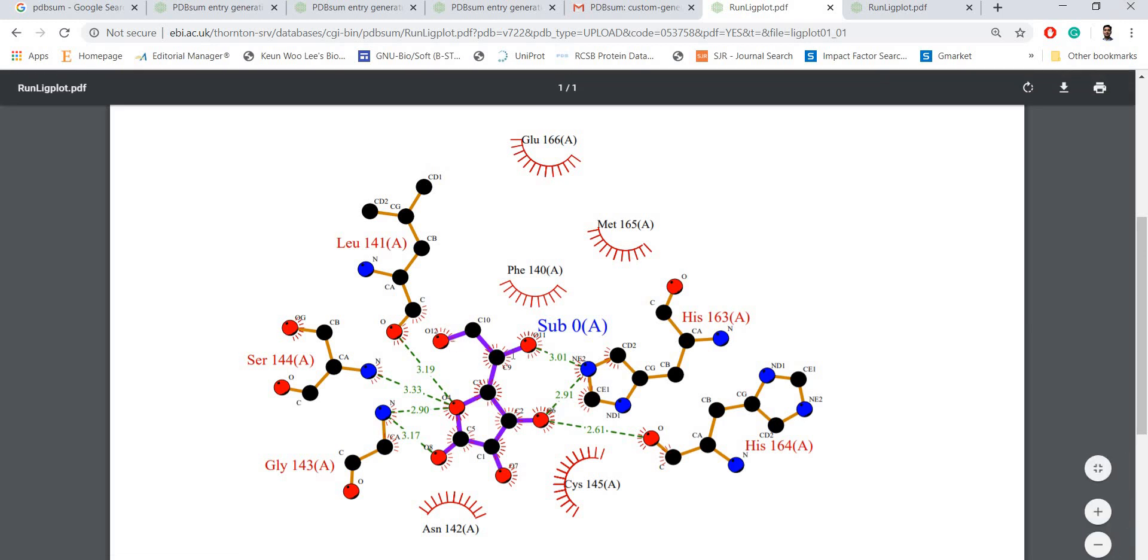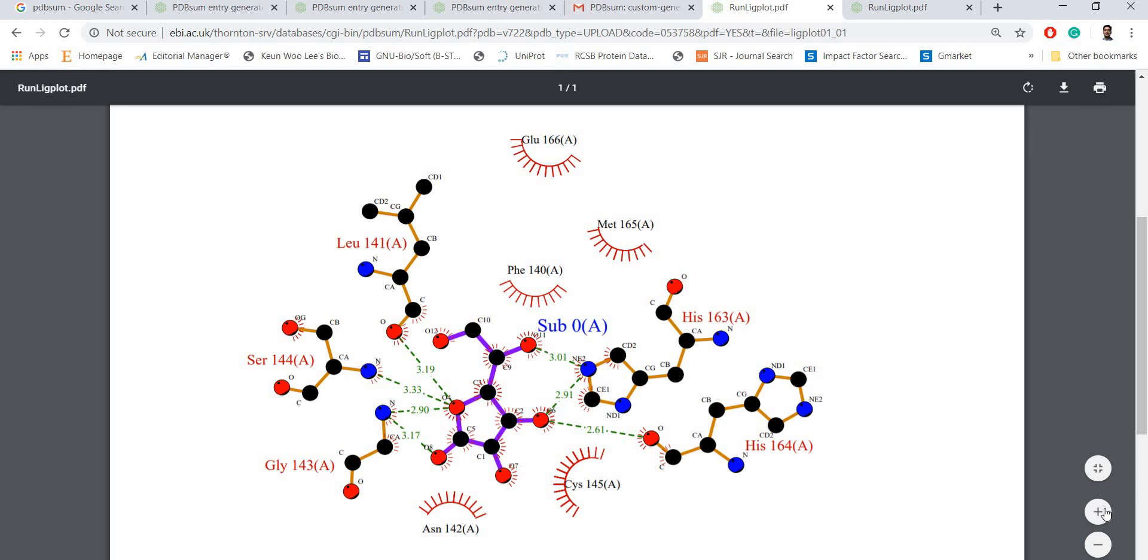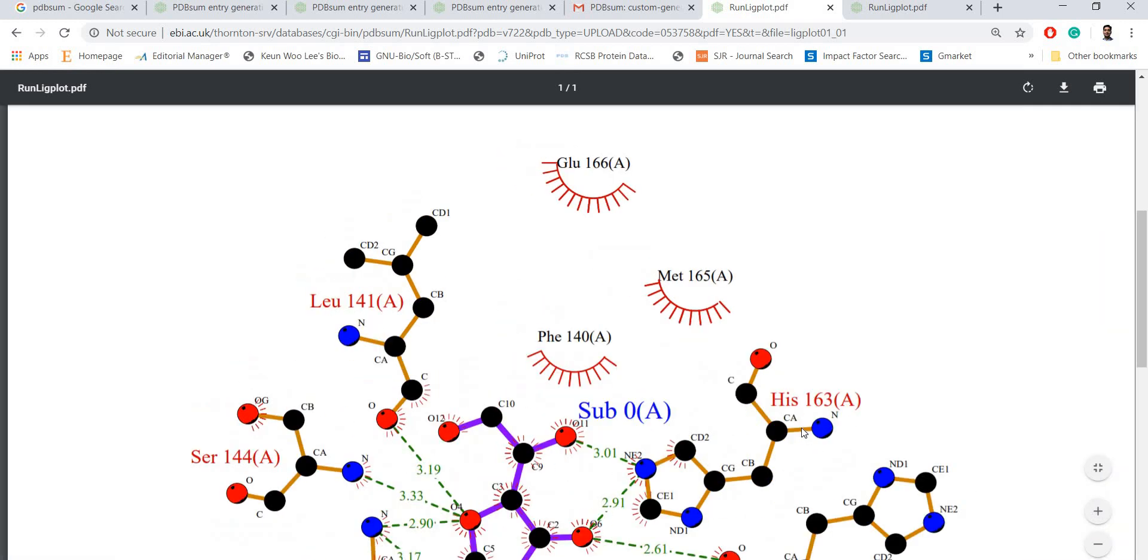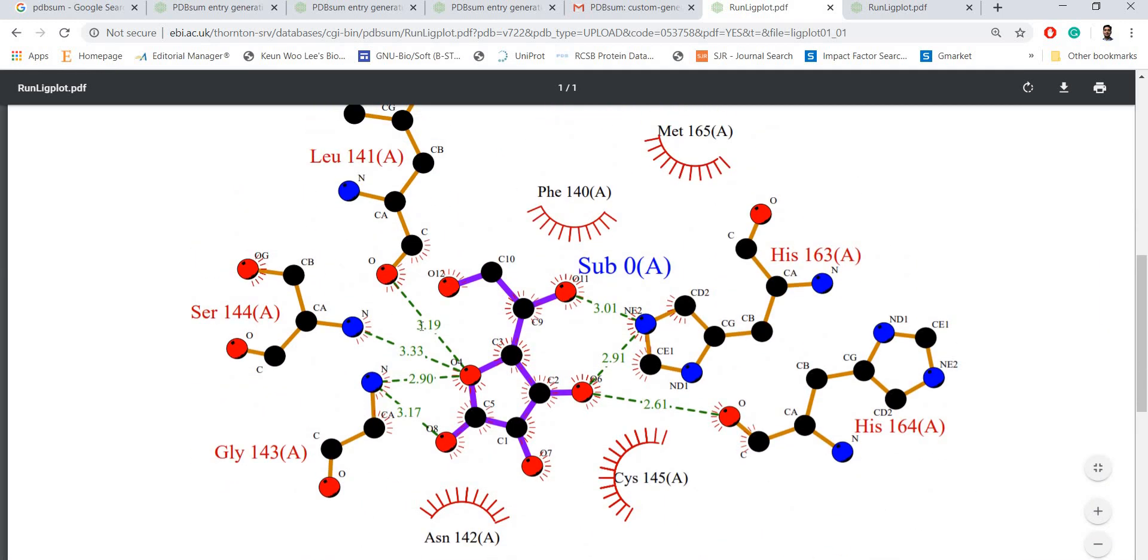You can see your ligand is colored in purple. Amino acids which are forming hydrogen bonds are colored in maroon and the hydrogen bonds are represented in green dotted lines.